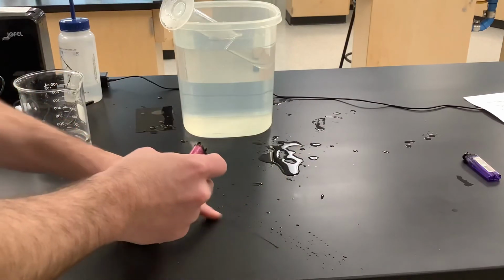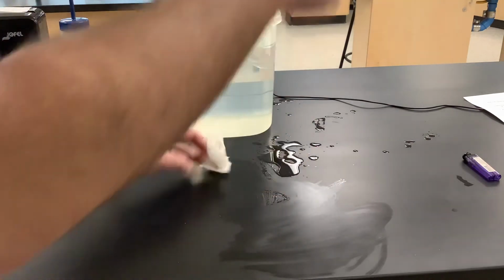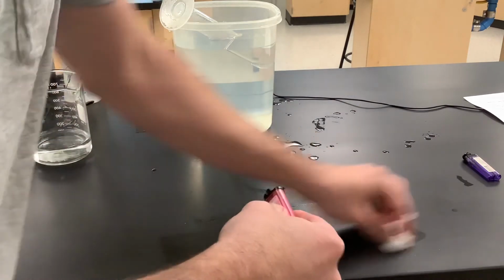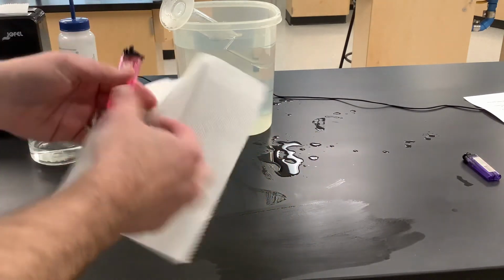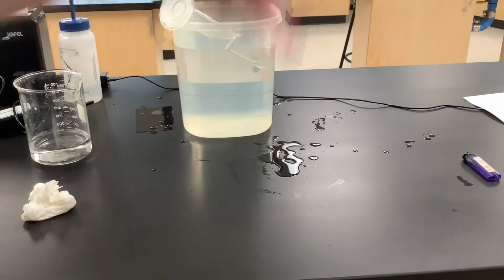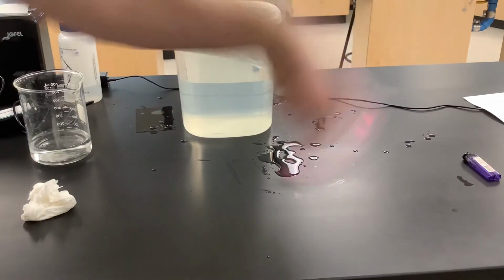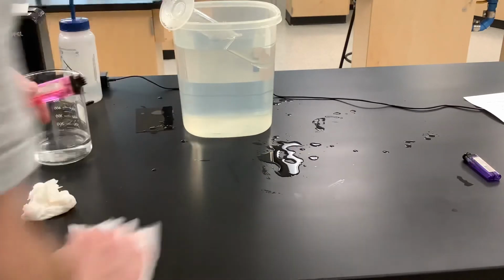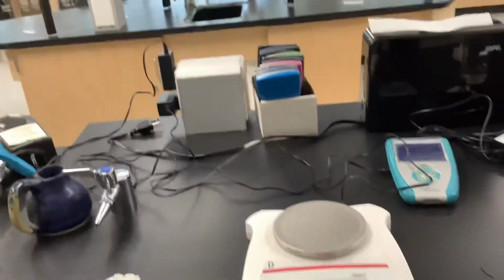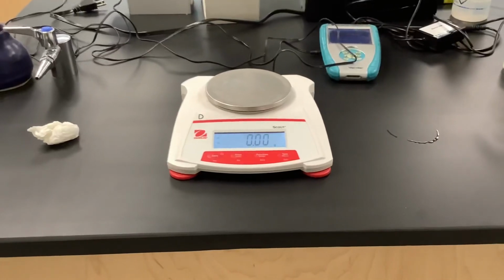So when I shake it, we can see that there's water that's trapped inside of there. So usually what I do is I'll just kind of clean up. I just keep on shaking it until I don't get any more water coming out of it. Okay, so we can go ahead. It looks like it's coming out pretty clean. Let's come on over to the scale and see what we get with the scale.